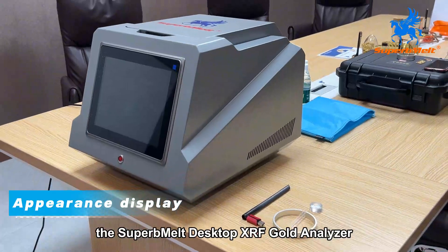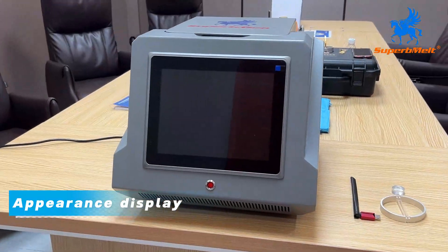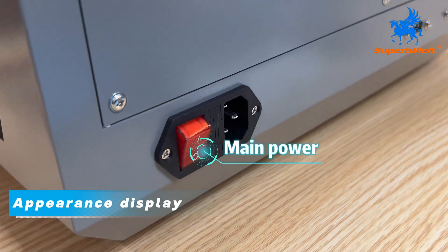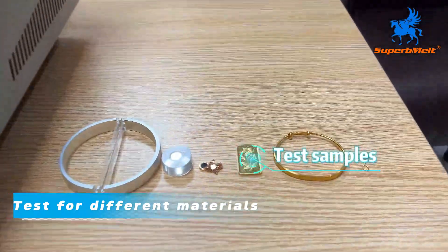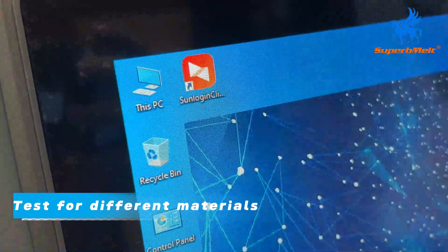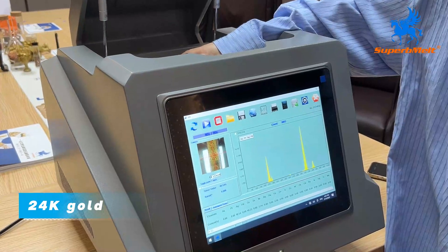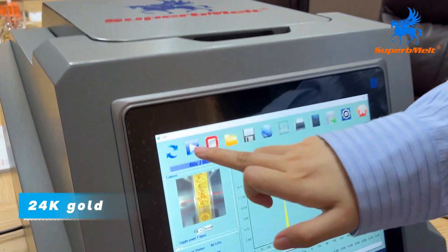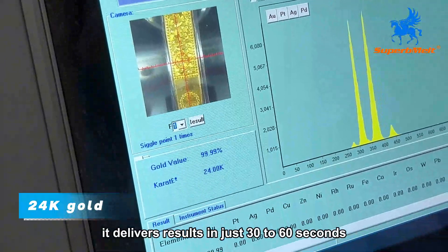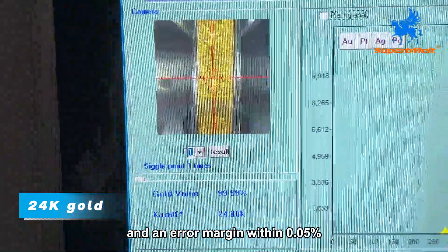The Superb Melt Desktop XRF Gold Analyzer is designed for stable and precise detection of precious metal compositions in jewelry. Capable of analyzing 74 elements from potassium to uranium, it delivers results in just 30 to 60 seconds with an accuracy range of 0.01% to 99.99% and an error margin within 0.05%.